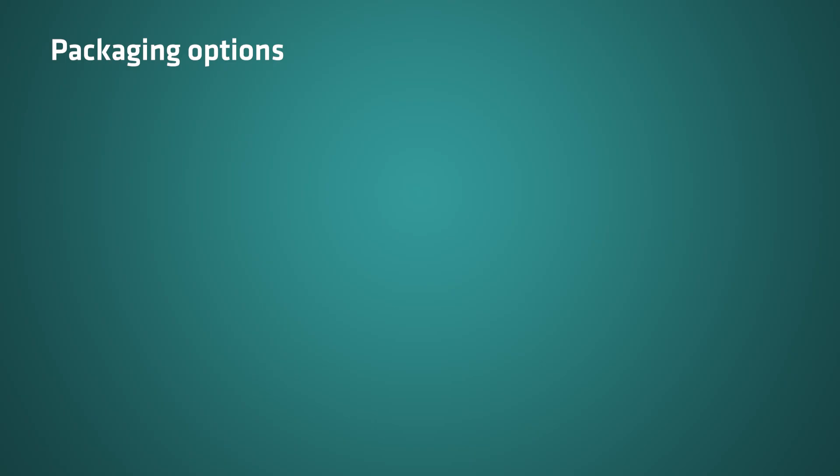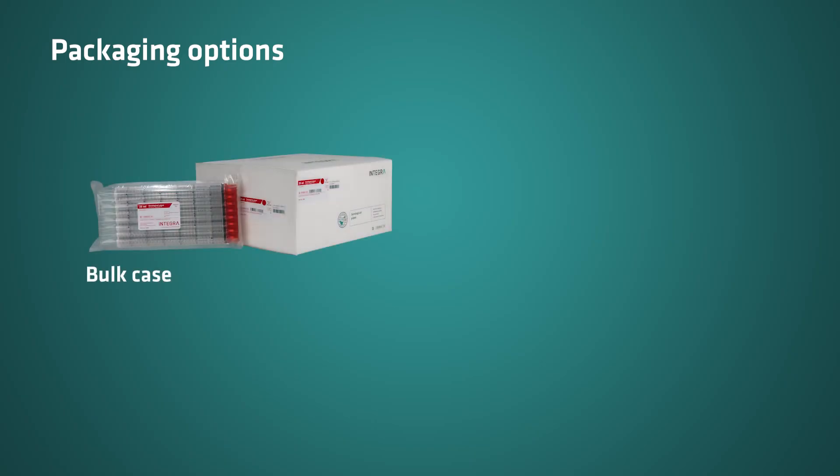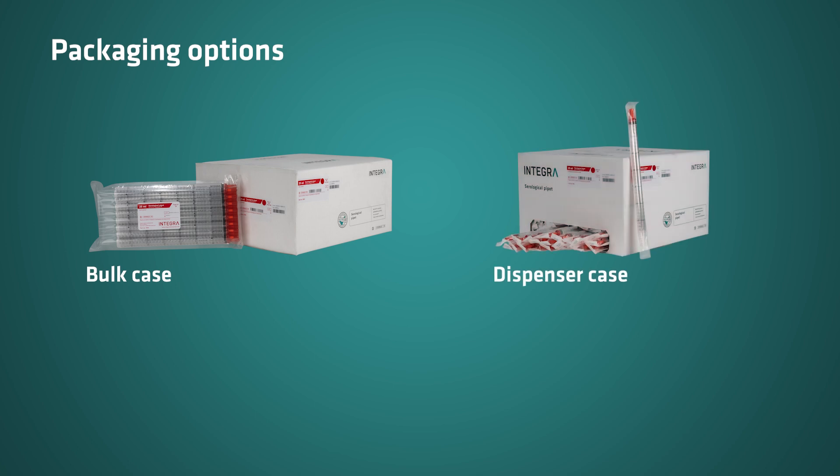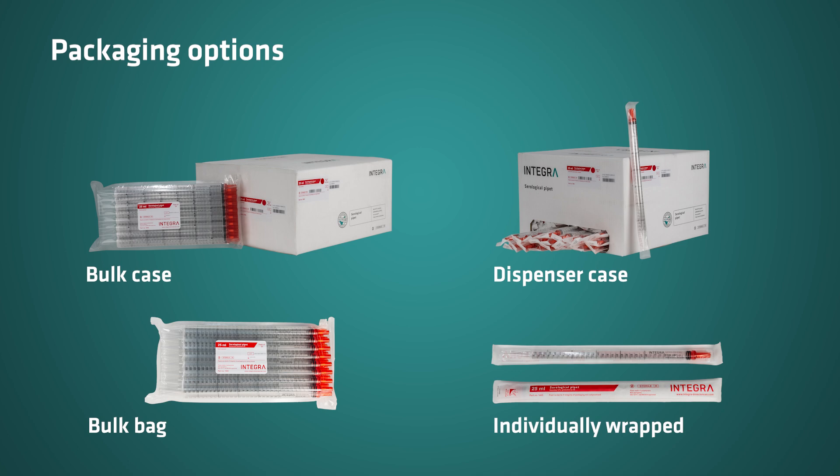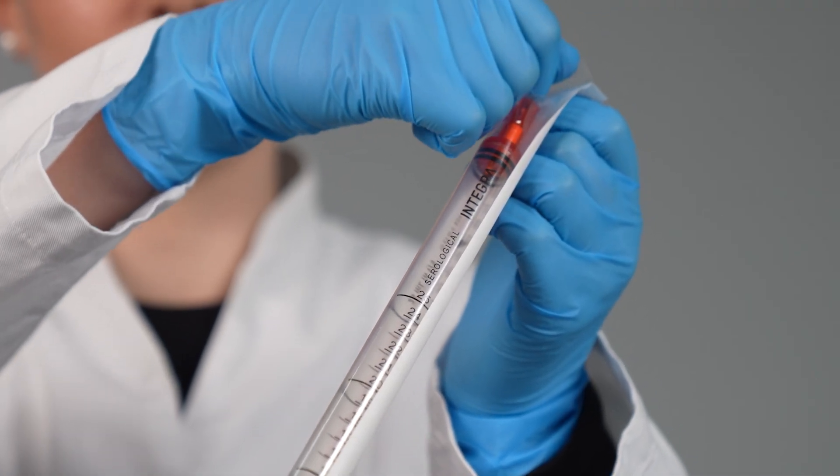The Integra serological pipets are available in bulk packing or individually wrapped. The bulk pipets come in resealable bags, while the individually wrapped pipets are easy to open and delivered in dispenser boxes, enabling quick and easy access.